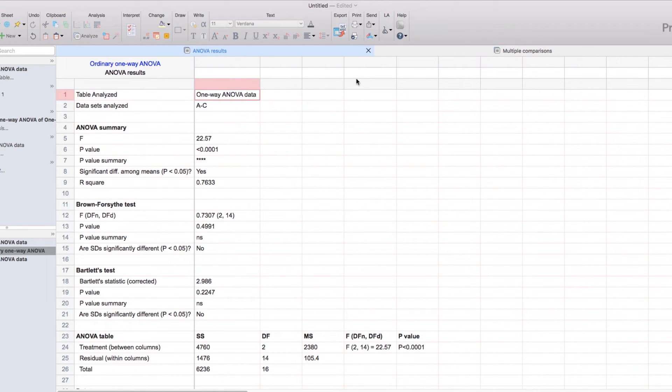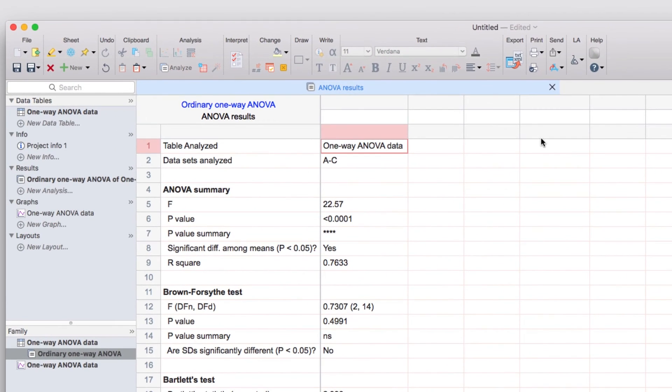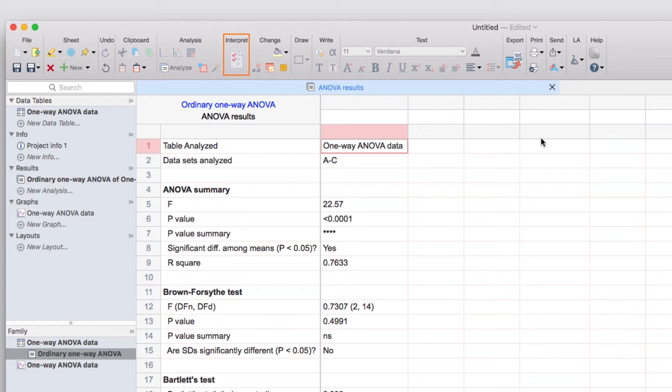Importantly, when you're looking at an analysis results sheet, a new option will have appeared in the toolbar. The interpret button will take you to an analysis checklist online that helps ensure you made the right choice of analysis and will explain the underlying assumptions of the analysis that you chose.